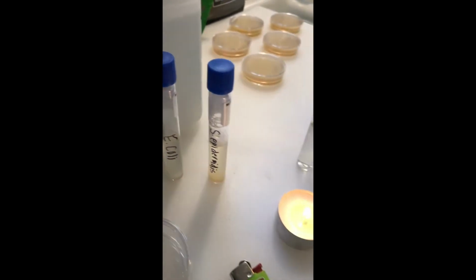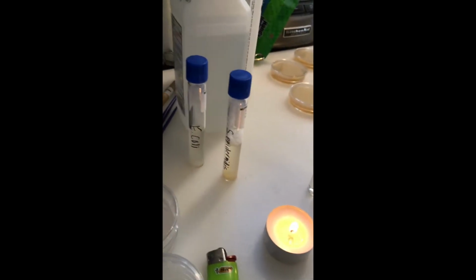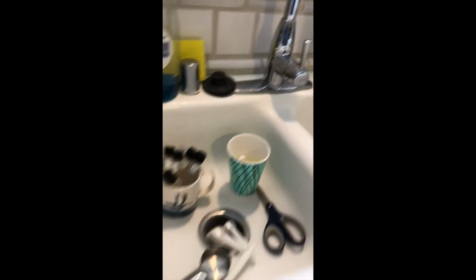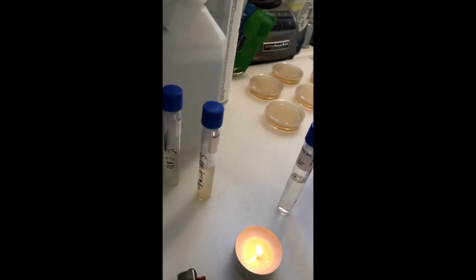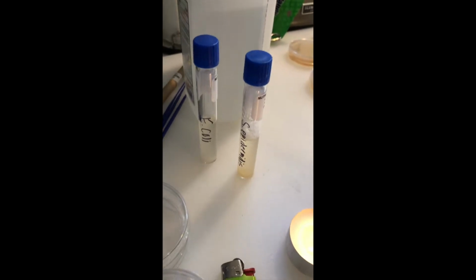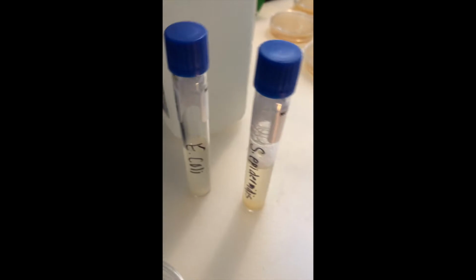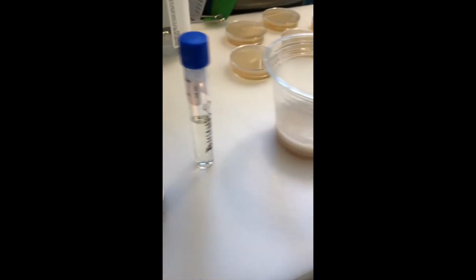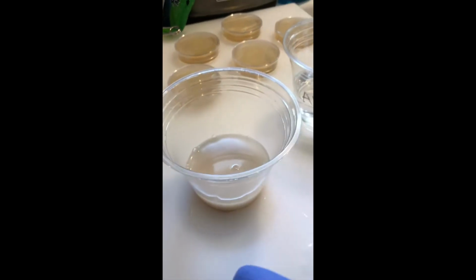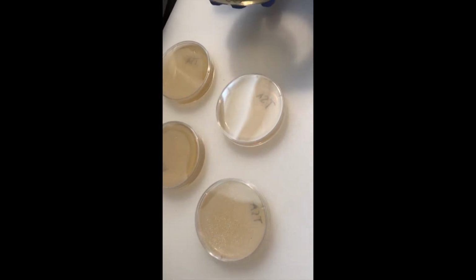nutrient broths into the two test tube samples, which are now sitting in bleach solution so that they can be thrown away. And I had to shake vigorously the two test tubes so that the tablet dissolved. And then once dissolved, they were transferred back into the two nutrient broths. And now I'm just waiting to repeat the same process for the yeast, waiting 10 minutes for it to froth.